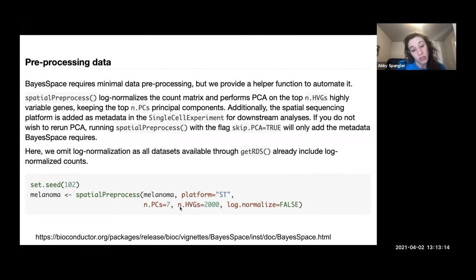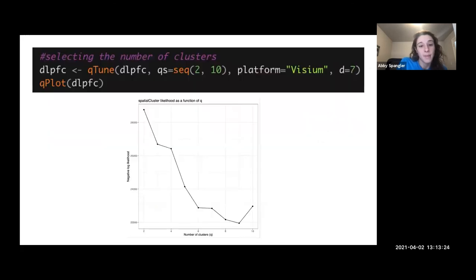You can choose the number of highly variable genes you want, and you can also choose the number of principal components that you want to use. So then we do the Qtune function, which is going to run the clustering algorithm for a range of clusters. You can choose this range, and then D is the number of PCs.